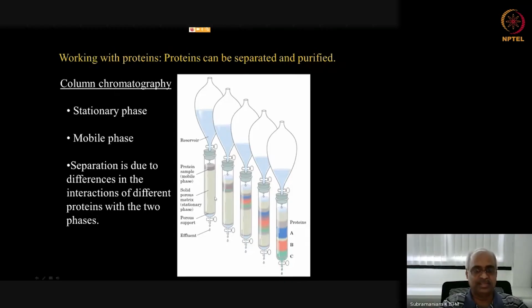For example, here you see a cylindrical tube with a stopper at the bottom, and you have a porous material packed here, and so that it itself doesn't go through, you have a frit added and then it doesn't get disturbed because we have added another thing. Now you have a liquid that is going through. So if a set of molecules is applied on the top, in this cartoon you have gravity causing the phase to flow. So this flow equals, in the counter current distribution, the mixing and allowing the phases to separate. Okay. So instead of doing it in discrete events, here it is a continuous process.